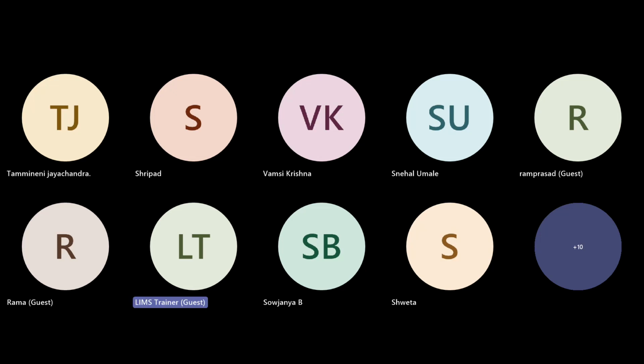Crystal Report is itself one separate topic, so that is not covered. Crystal Report is reporting in LabWare LIMS. If you go into the Crystal Report manual, it's a 2,500 page thing. Crystal Report is not a part of LabWare LIMS. You create reports using Crystal Report in LabWare LIMS. You got it? See, Crystal Report is created by SAP. So there is software, SAP Crystal Reports. There you go and create the Crystal Report.